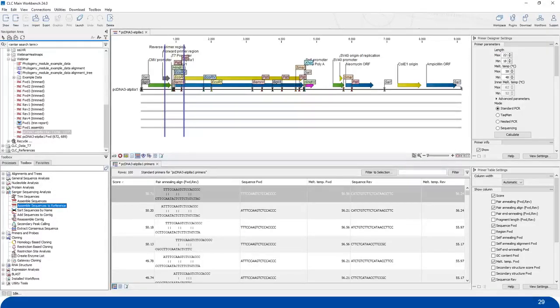Yeah, so from my experience, users that are working with CRISPR typically utilize the tools that are found with the upgraded version of the main workbench, which is the genomics workbench. That one is awesome at handling NGS data, and it does provide you with some awesome tools to take a look at that CRISPR data. So if you guys are interested, we do have a trial link in the slides that Kristen provided, or you can also reach out to us and we'd be happy to help you as well.